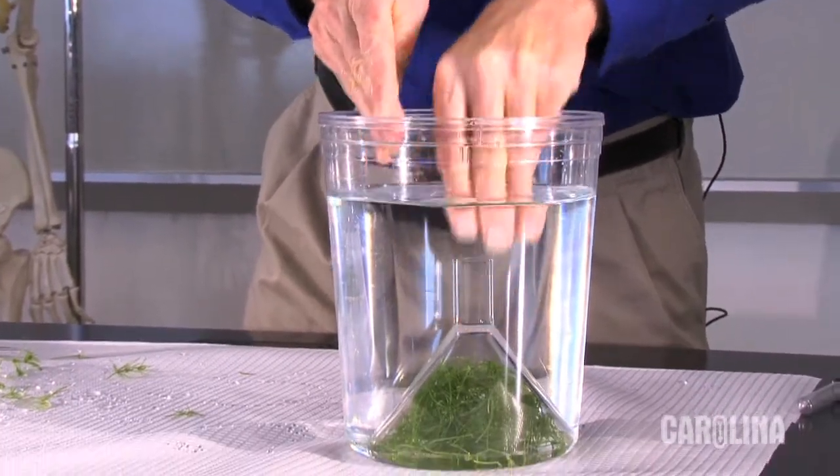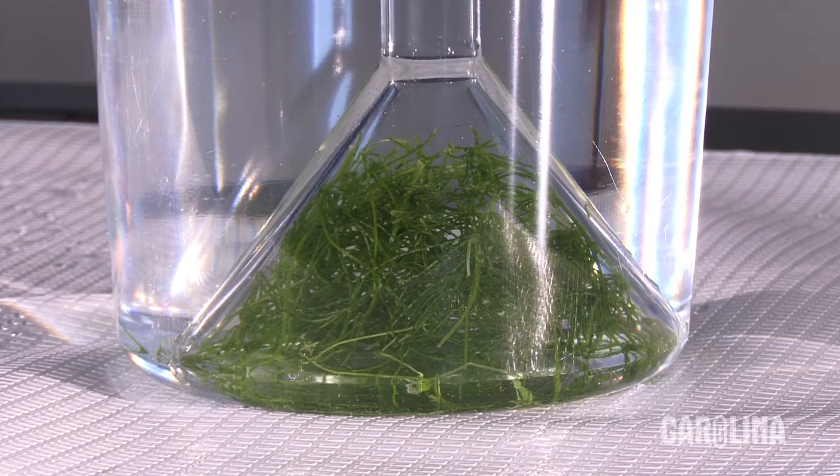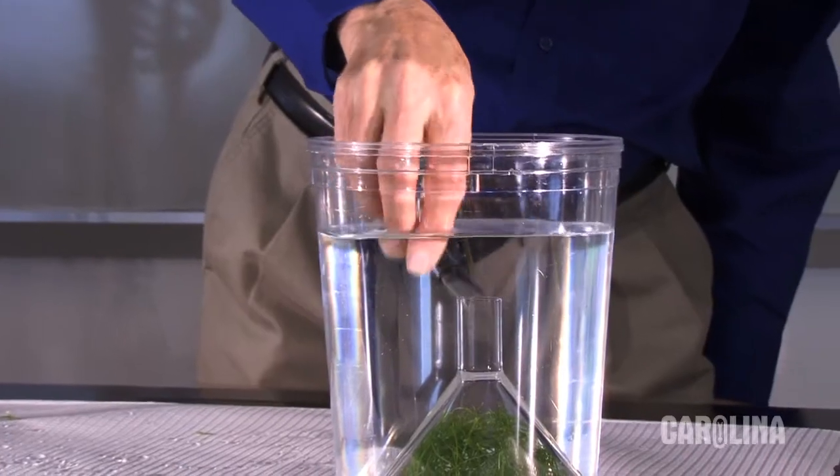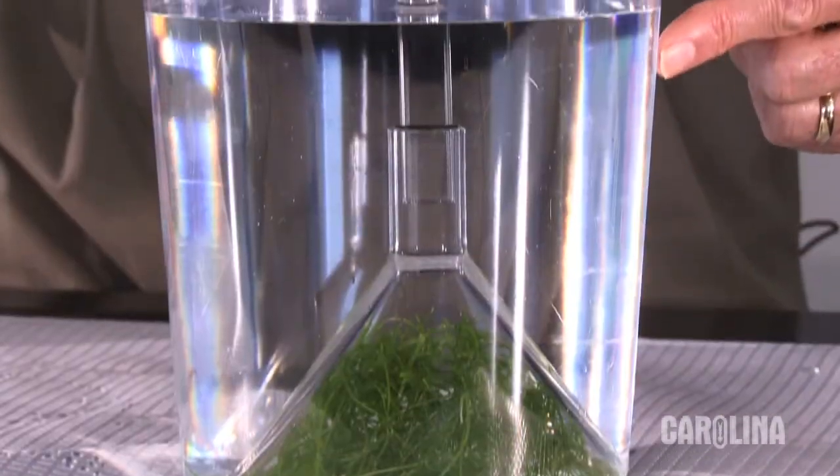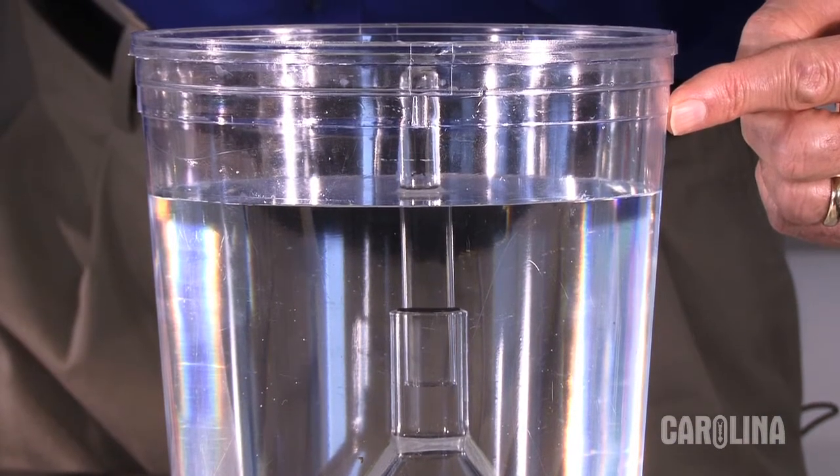And the funnel goes into the water like this. Fill the test tube with water and upend it over the funnel. Oxygen produced by the plants will enter the test tube and displace the water.